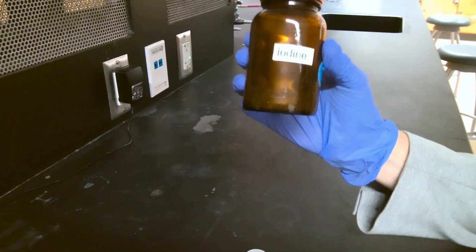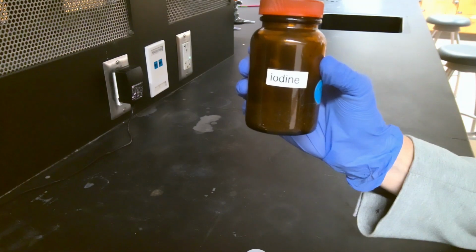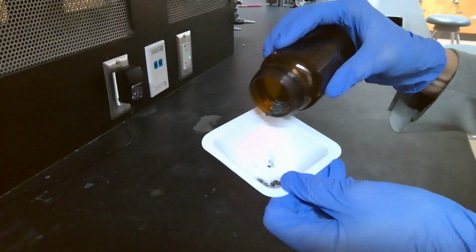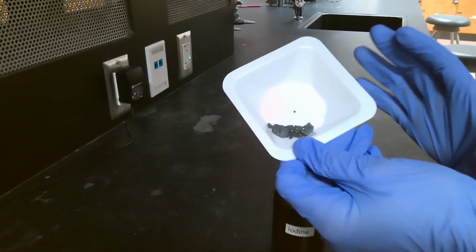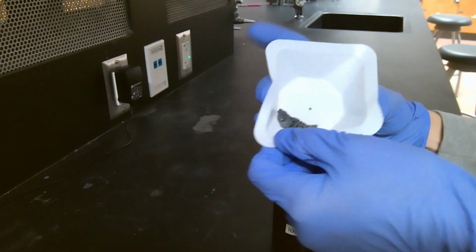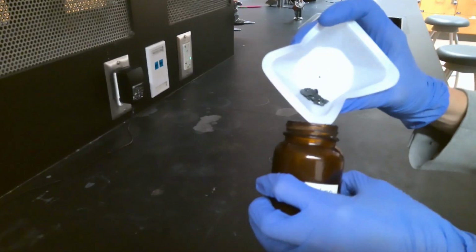The next compound is iodine, I2. Iodine is a group 7 element, and like all group 7 elements, it's really reactive. This reactivity is what makes it particularly dangerous. It's a solid, dark gray, shiny compound, very brittle in nature. It also has the tendency to turn into a purple gas at room temperature.